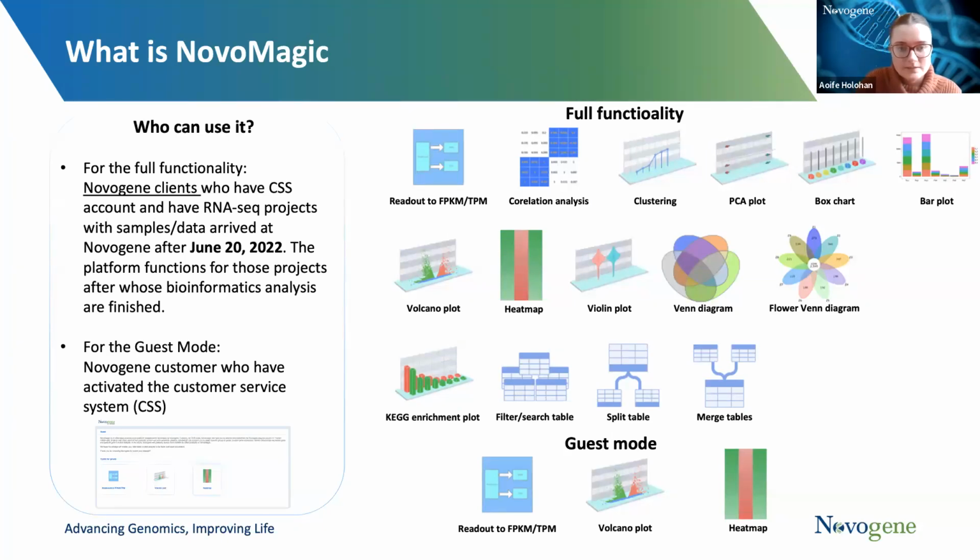So I think this question will be the last one, from Danielle. Can NovoMagic be used for small non-coding RNA analysis projects? Yeah, so far it's a no. It's a pity though. NovoMagic is only available for messenger RNA sequencing analysis projects.